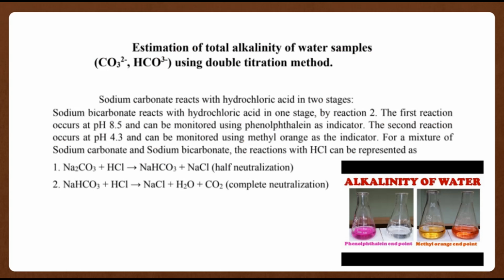An example for a double titration experiment is as follows. The estimation of the total alkalinity of water samples, CO3 2- or HCO3-, using the double titration method. Sodium carbonate reacts with hydrochloric acid in 2 stages. Sodium bicarbonate reacts with hydrochloric acid in 1 stage, by the second reaction.